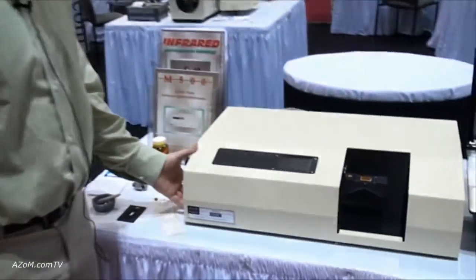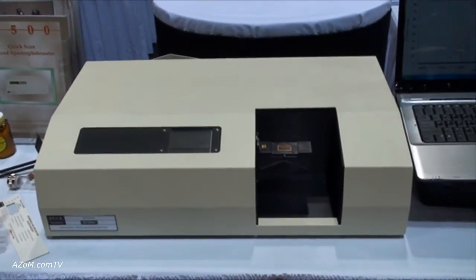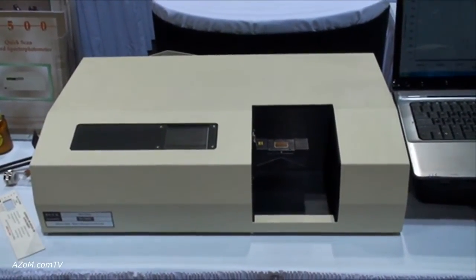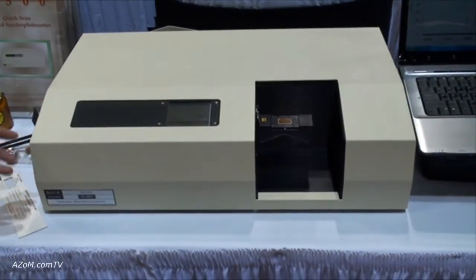So this is our model 530. This is actually the prototype of our new instrument, but it's very similar to our current M500 infrared spectrophotometer, which is a dispersive infrared spectrophotometer.